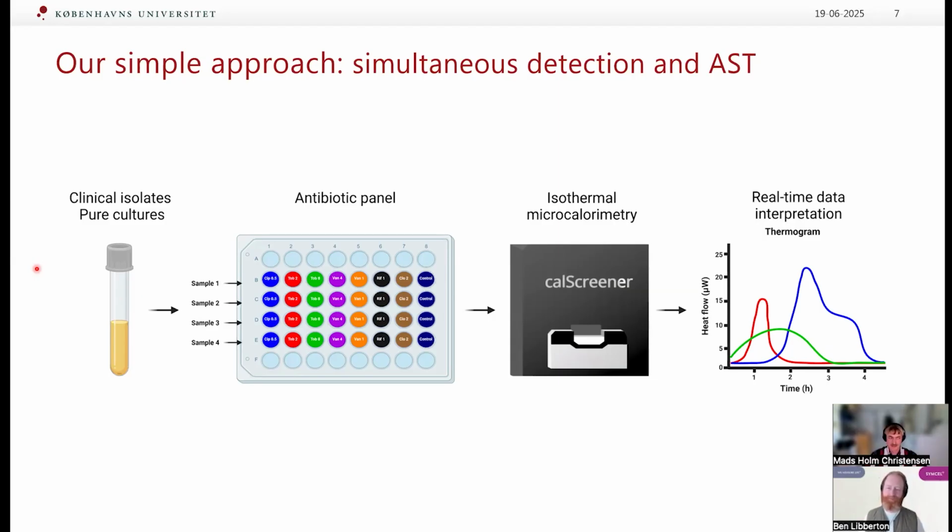Yeah, I have used microcalorimetry before to look at Cutibacterium acnes cultures, and of course they are very slow growing, and it takes several days before you can even see colonies if you put them on a plate. But I actually managed to see a stable signal already after 40 hours, I think it was. So definitely you see something with this method before you see anything on the traditional culture-based methods. Cool.